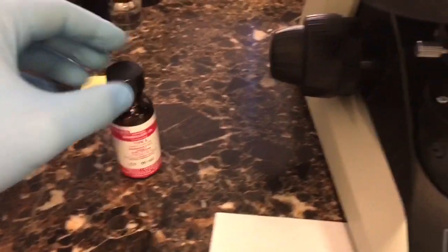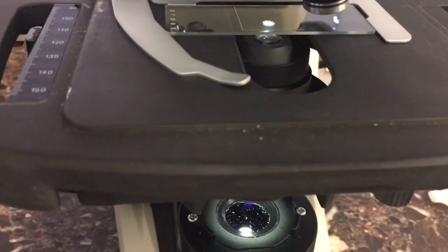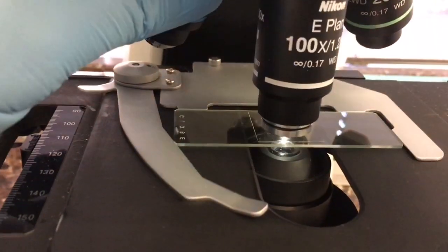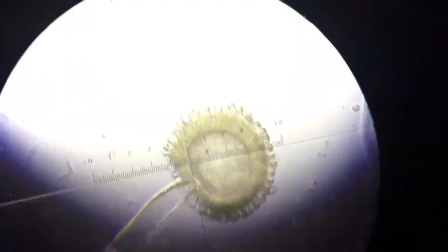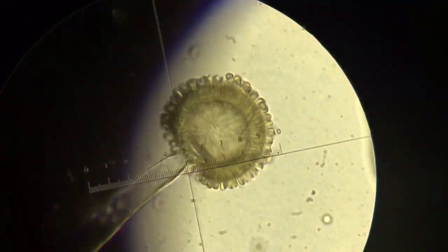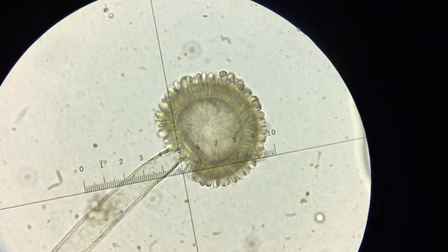So these tubular, kind of sausage-shaped structures are then producing the spores which are made one after another and usually attached to each other in a chain. I'm going to 100x here for the high detail so we can see more of the structure. There we go. So we use a term with Aspergillus.